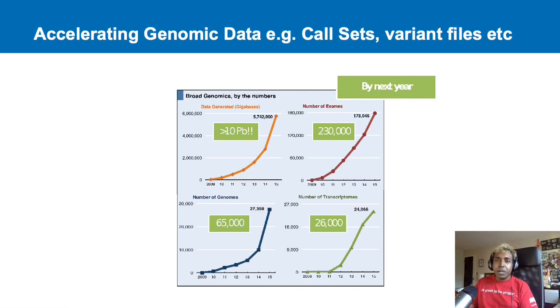To appreciate this better, Hail was developed by looking essentially at this plot here that was taken from the Broad Genomics group, from Genomics in the Cloud, which is a book on Amazon that Geraldine Vandermeer wrote. She's the engagement person I was mentioning in the last video, well, two videos ago.